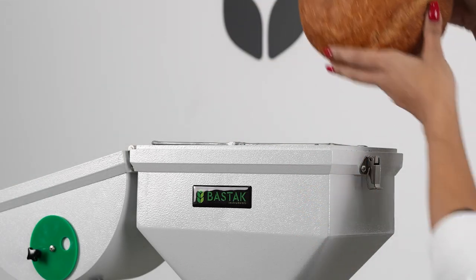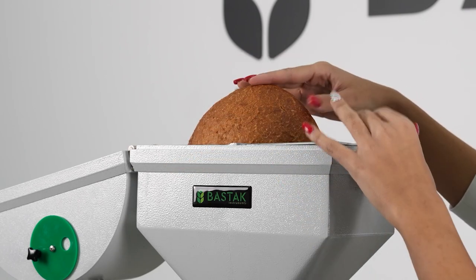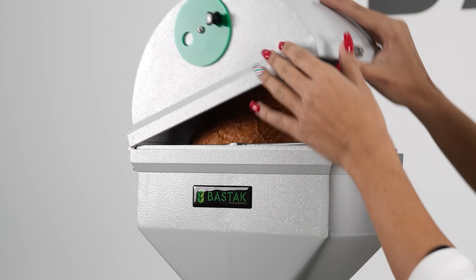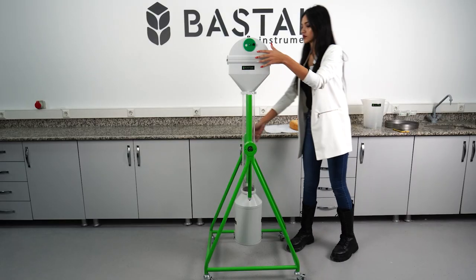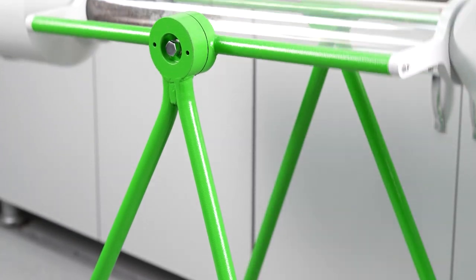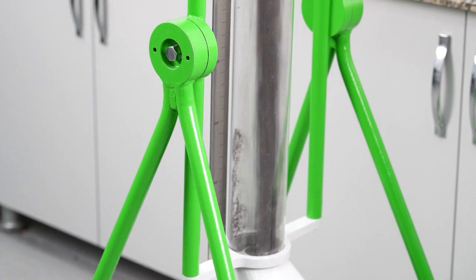After placing the sample to be measured, the cover is closed and the chamber is locked for the volume measurement process. Afterward, the device is rotated 180 degrees to transfer the seeds onto the surface, ensuring complete emptying and displacement of the seeds.